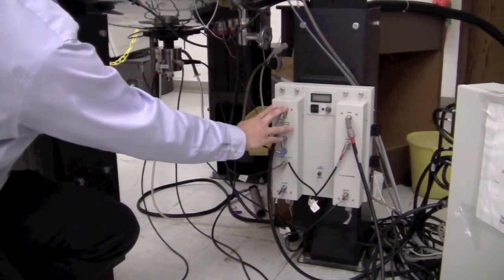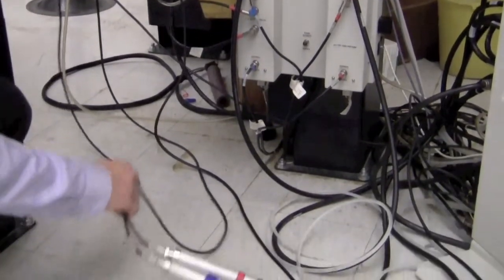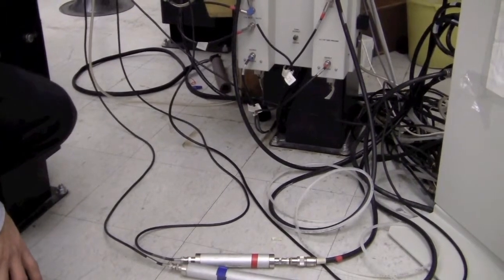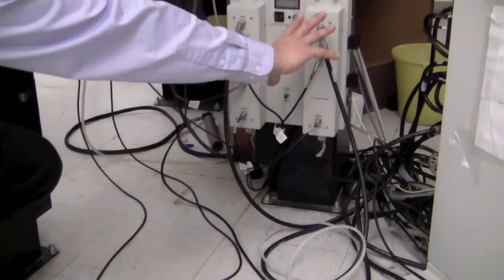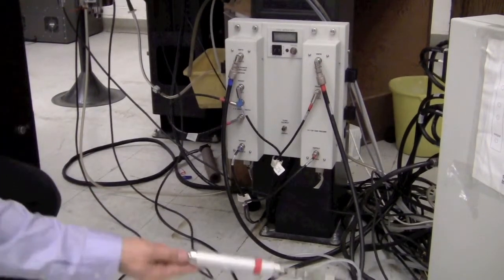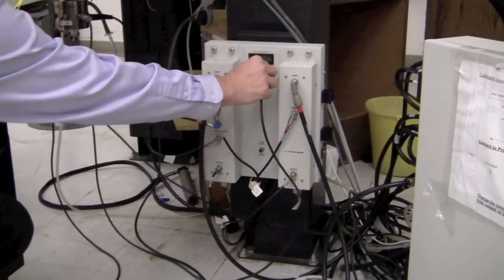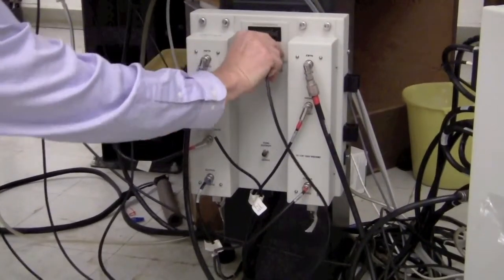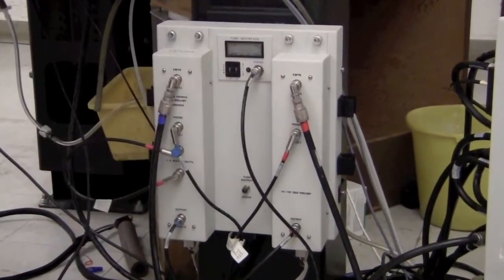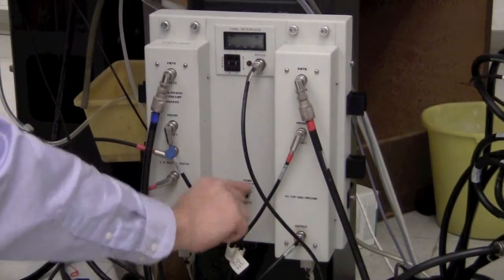The blue channel is where the signal is detected and where it goes into the probe. In order to tune the channel, we have to change the cables. I'll show you how to change the cables for the proton channel first. Take the proton channel probe connection and put it onto the tune interface where it says 'probe.' Push the connection on and turn it so it locks in. Then take the proton output and put it onto the tune output.